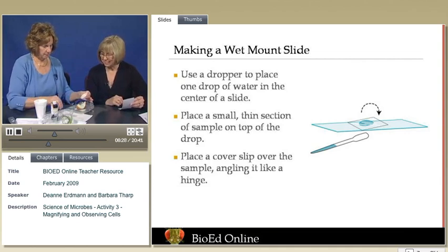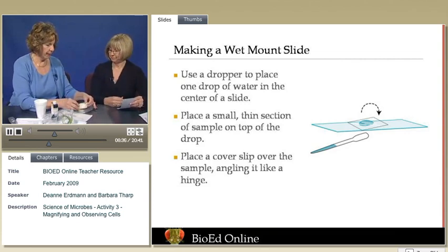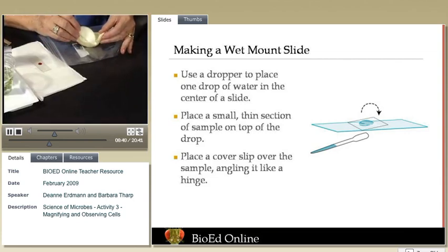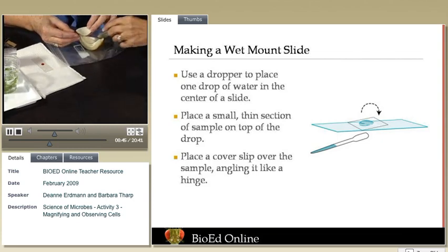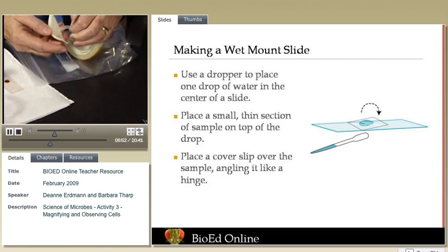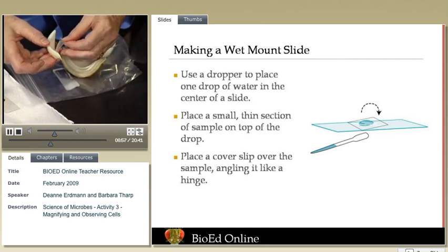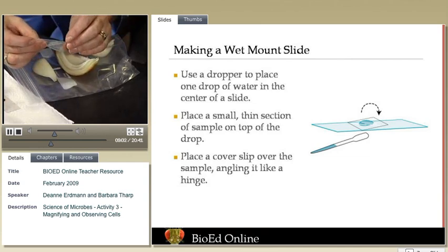So when you think about what is the skin exactly, Deanne, what are we looking for here? Well, when we take the different layers of onion, and really we used the razor blade or a scalpel or a knife earlier to cut some wedges like this, but when we look at the onion, you can pull off whole little sections. I see, really. And there's a very, very thin layer. Look right there, you can get that edge. Yeah, oh, there we go. There's a very, very thin layer that I can pull off, and that's just one layer of cells.